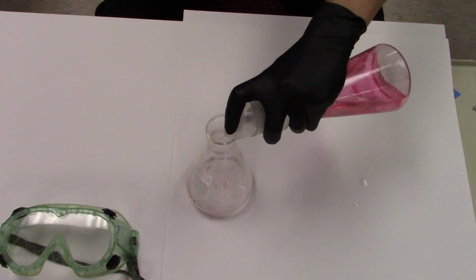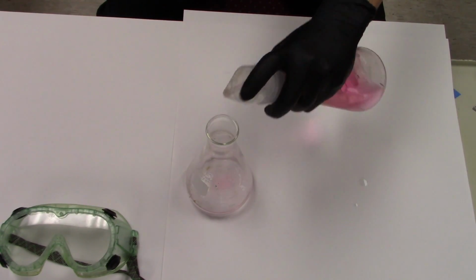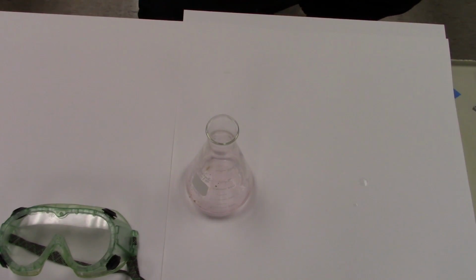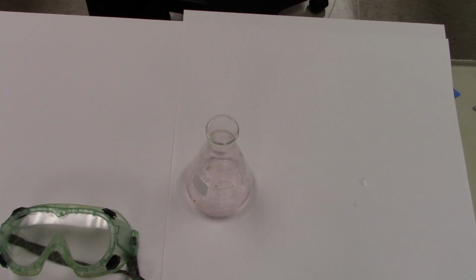The chemical formula for hydrogen peroxide is H2O2. So what's going to happen is we're going to decompose it. Now when you put hydrogen peroxide on your skin, it starts to bubble. What's actually happening is oxygen gas is being made. That's what the foaming sort of is. And then the hydrogen peroxide is being neutralized and turning into water. So that's what's going to go on in this reaction. We're going to make water and oxygen gas.